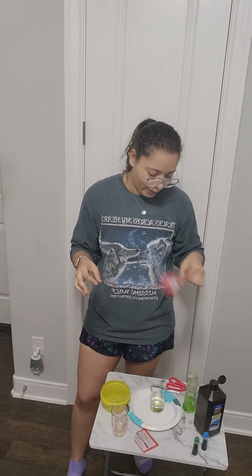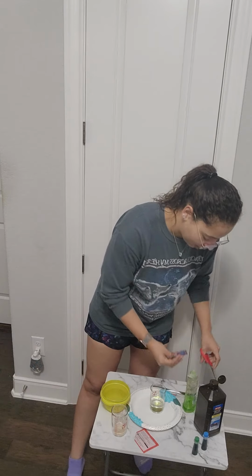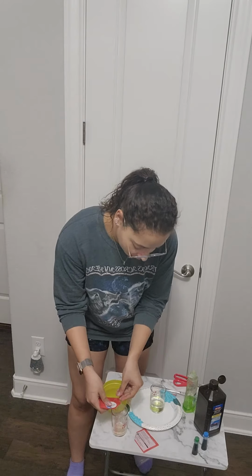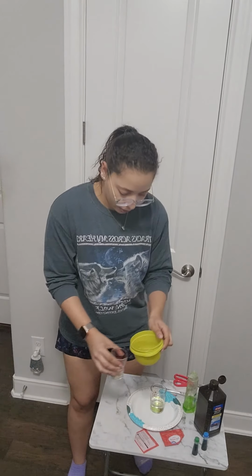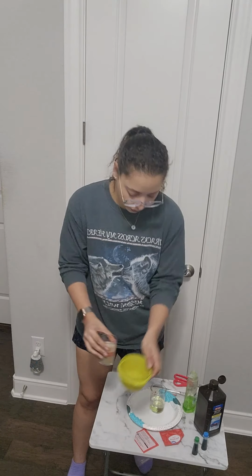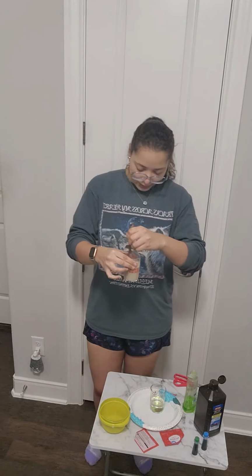Honestly, because I don't know how much of this to add, I'm just gonna open up a second pack. I'm not gonna use the entire second package, but I'm just gonna open it to add a little bit more yeast. Okay. And then we are going to put in our warm water. You can kind of see some of the foaming action of the yeast itself in the water. We're just going to give it a little mixy mix.